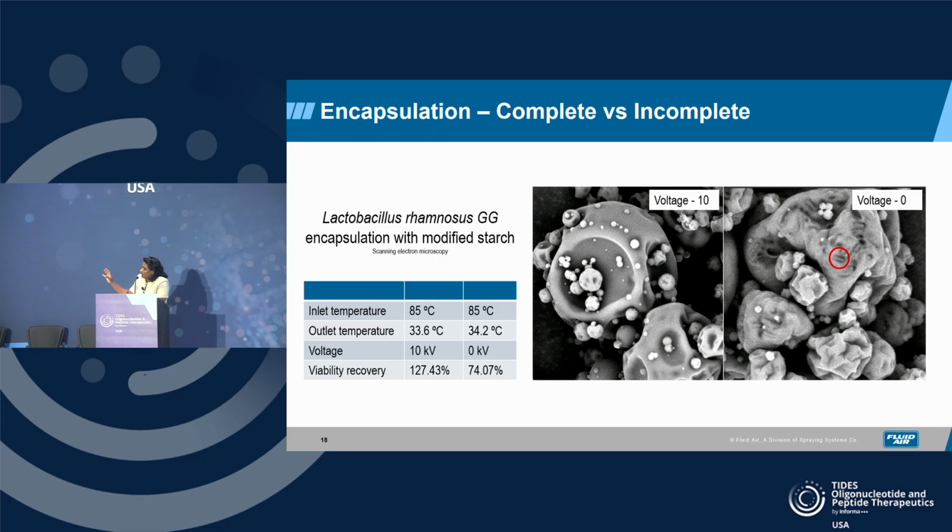So it makes for good visuals. So we have this here. It's not an application that's appropriate for this audience, but we think that this is a good visualization to show the encapsulation effect.